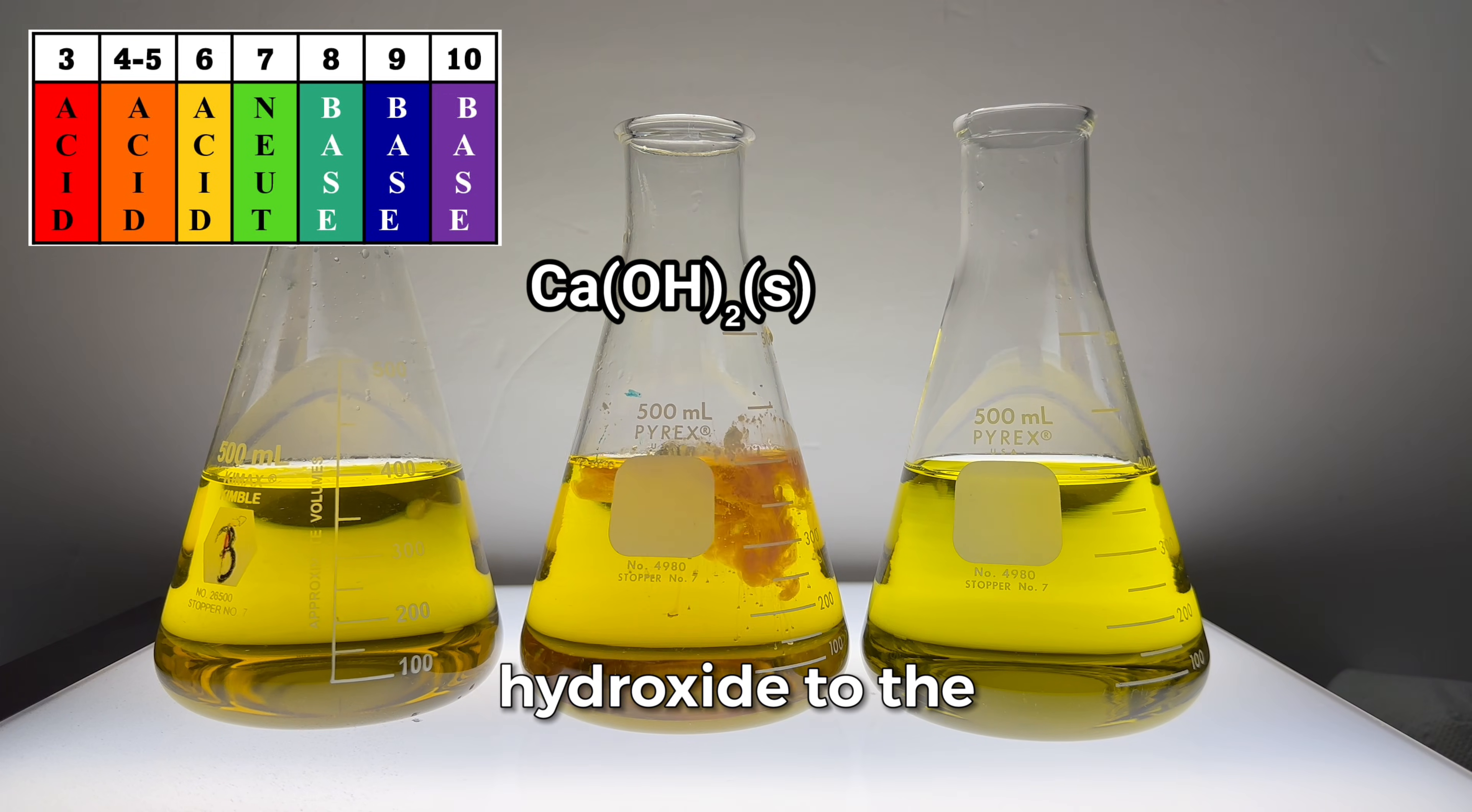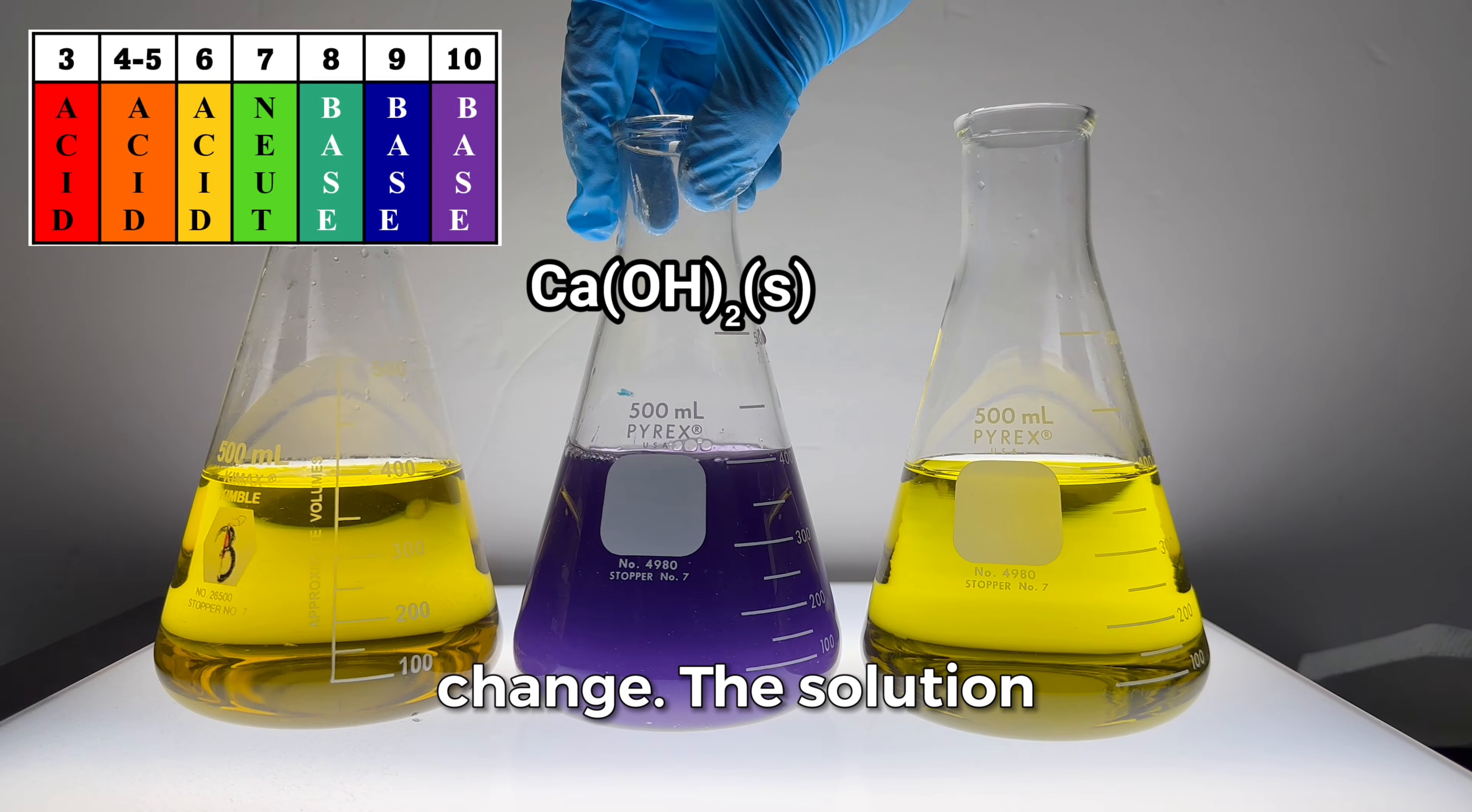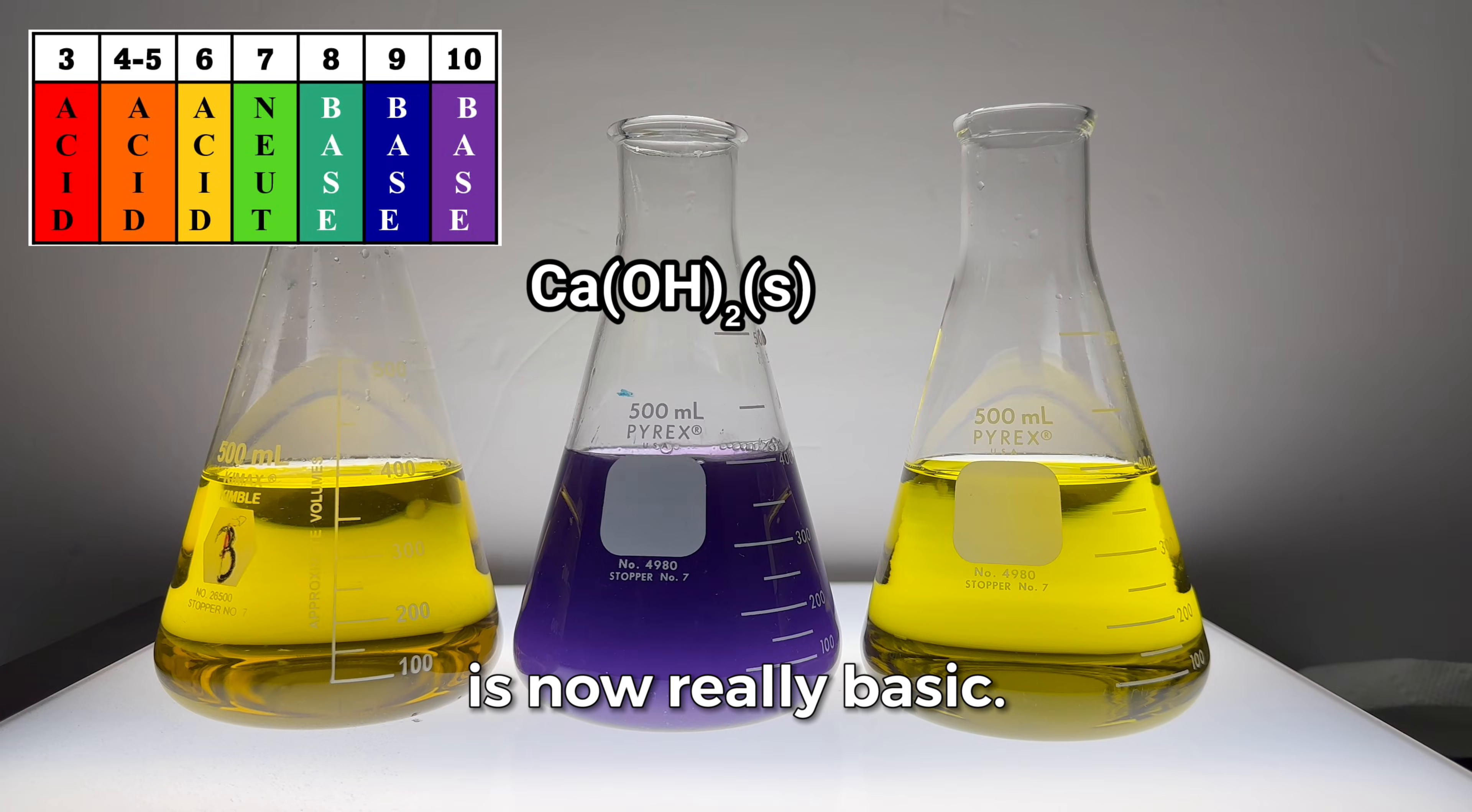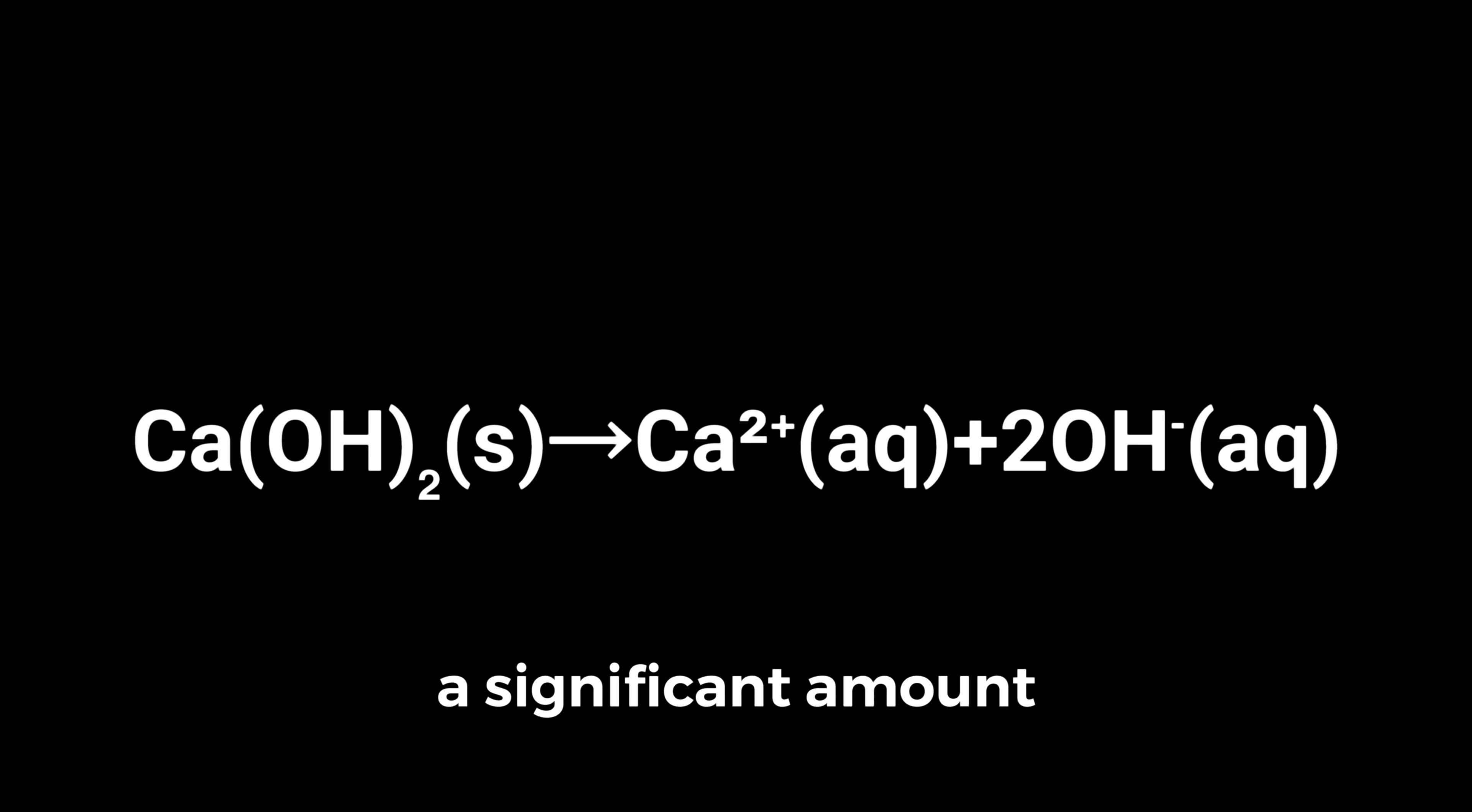Now let's add some calcium hydroxide to the middle flask. Whoa, that's a huge color change. The solution is now really basic. This happens because even though calcium hydroxide is sparingly soluble, enough of it dissolves to release a significant amount of hydroxide ions into the water.